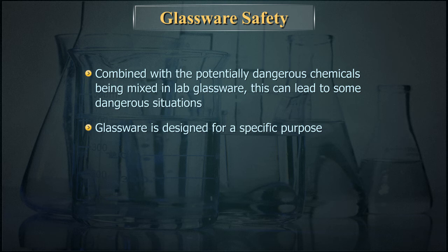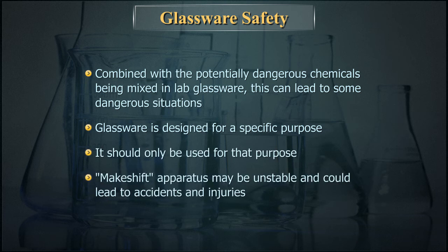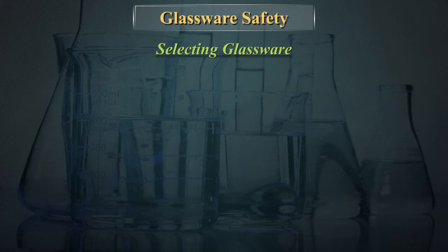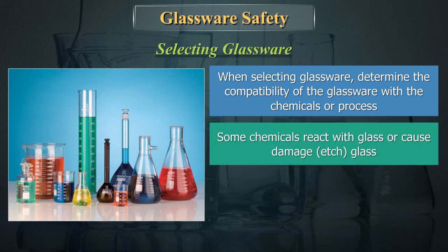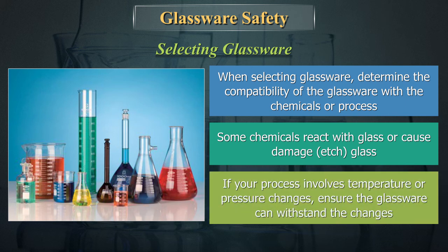Glassware is designed for a specific purpose and should only be used for that purpose. Makeshift apparatus may be unstable and could lead to accidents and injuries. When selecting glassware, determine the compatibility of the glassware with the chemicals or the process. Some chemicals react with glass or cause damage — etching the glass. If your process involves temperature or pressure changes, ensure the glassware can withstand those changes.